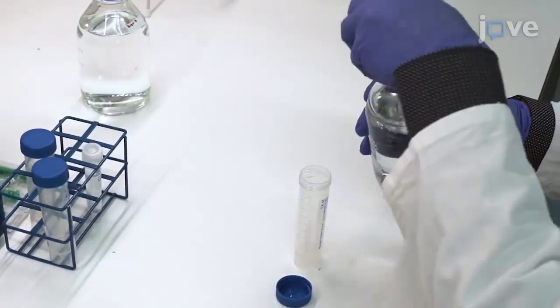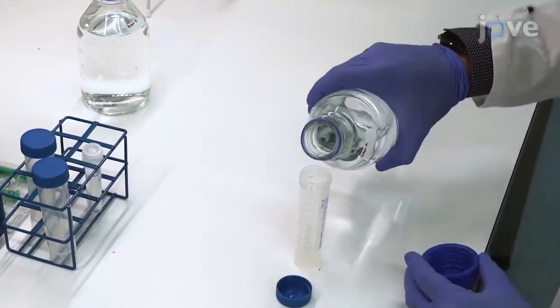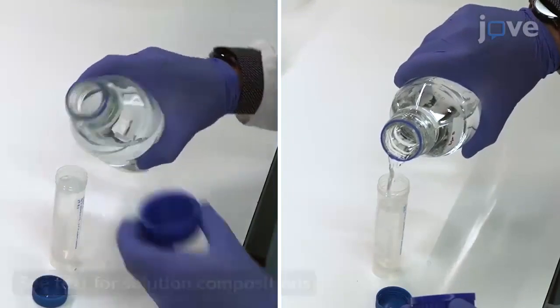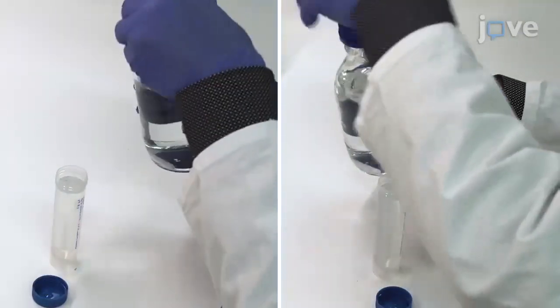For every 10 columns used for coupling, prepare 30 milliliters of deactivation solution, 30 milliliters of low pH solution, and 1 milliliter of storage solution.